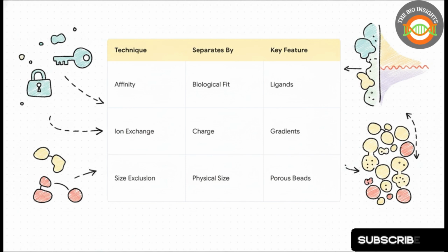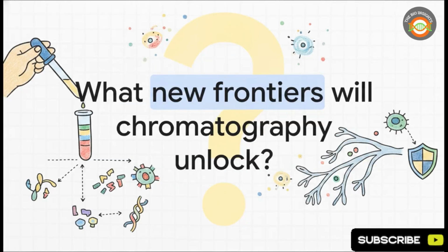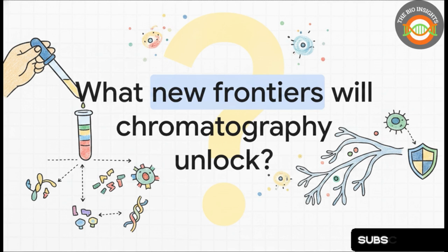And in the real world, scientists will actually chain these techniques together to get thousands-fold purification in just a few steps. It's pretty mind-blowing when you think about it. We are no longer just relying on natural biological interactions. We're out there actively engineering incredibly stable synthetic biomimetic ligands right in the lab.